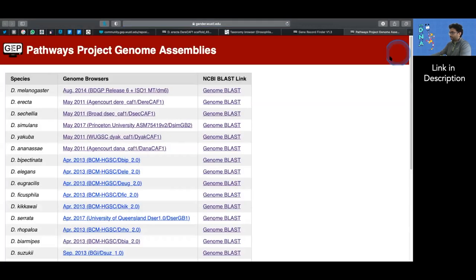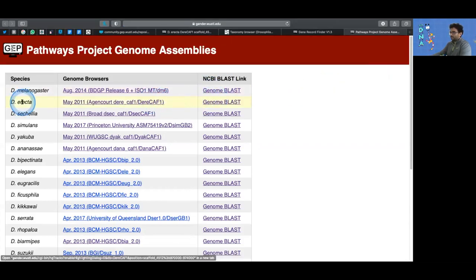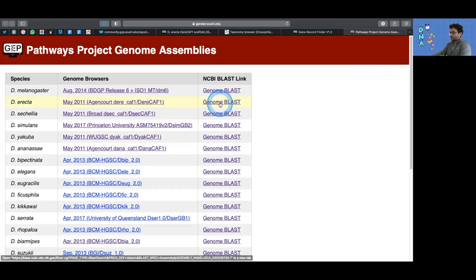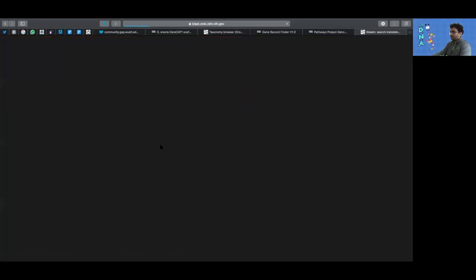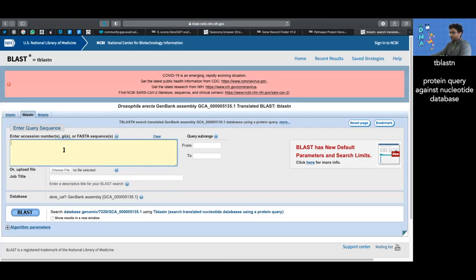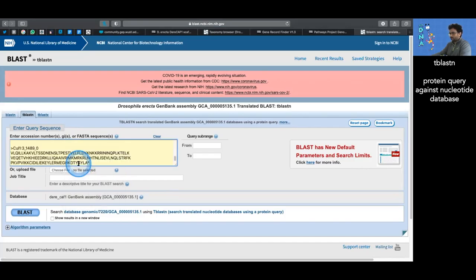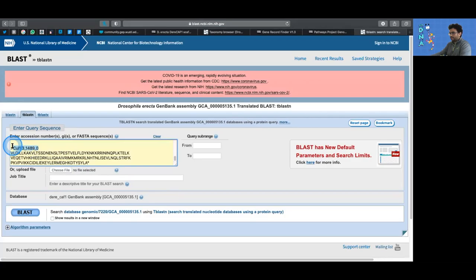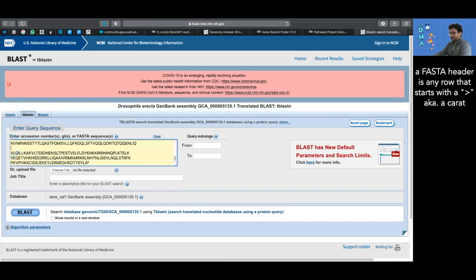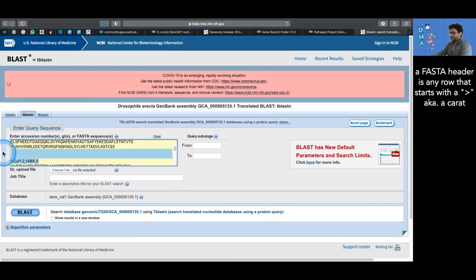Then we need to go and BLAST it. To find BLAST, let's go to the Pathways Genome Assemblies page, find our assembly, in this case Drosophila erecta, and click on Genome BLAST, which takes us to the TBLASTN of our specific assembly. TBLASTN blasts a peptide sequence against a nucleotide database.